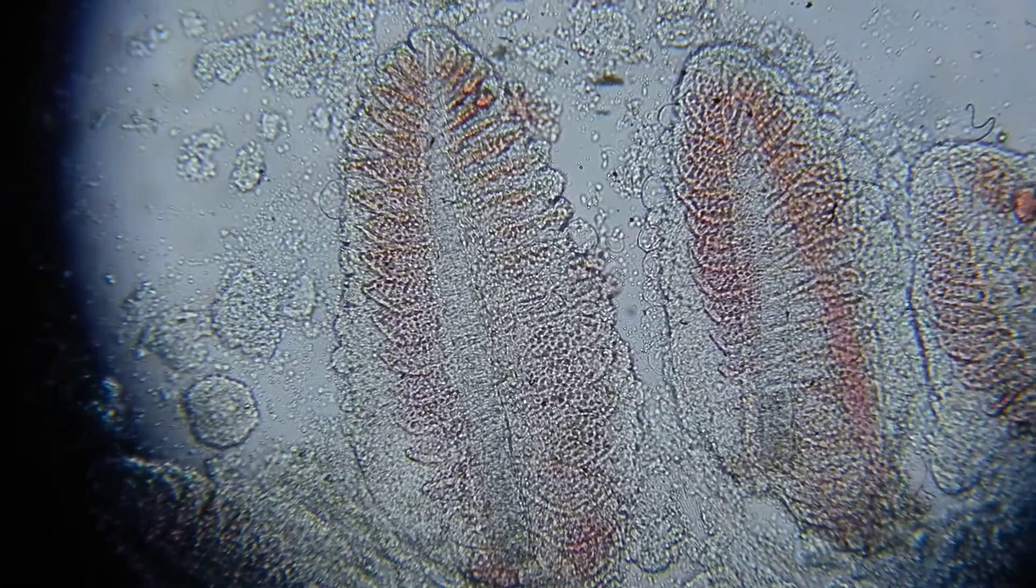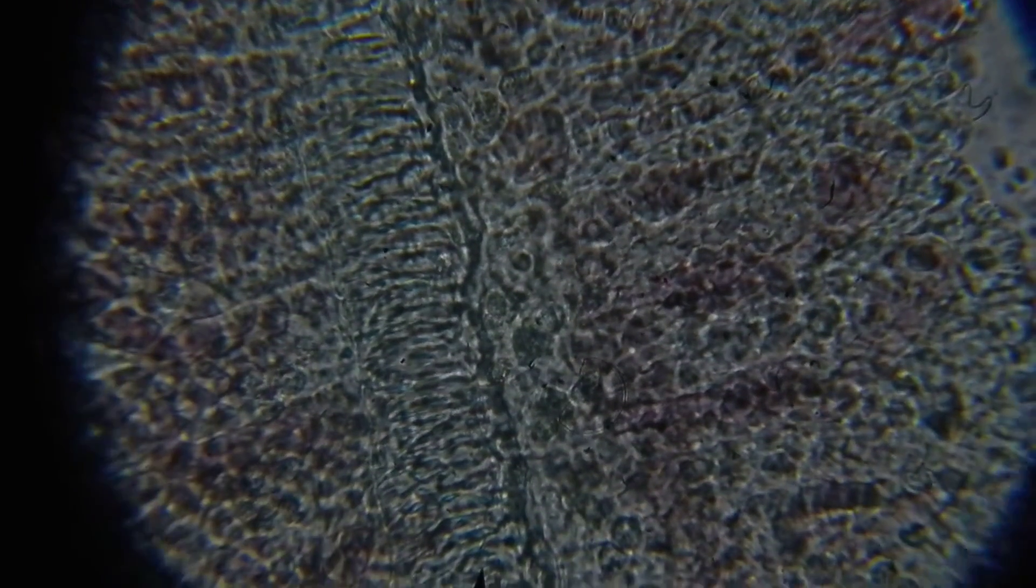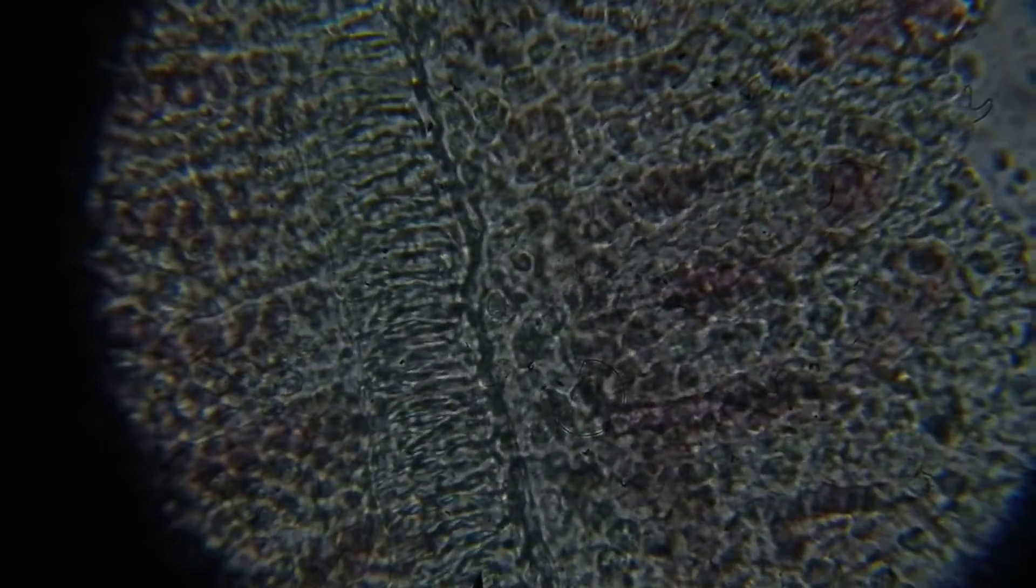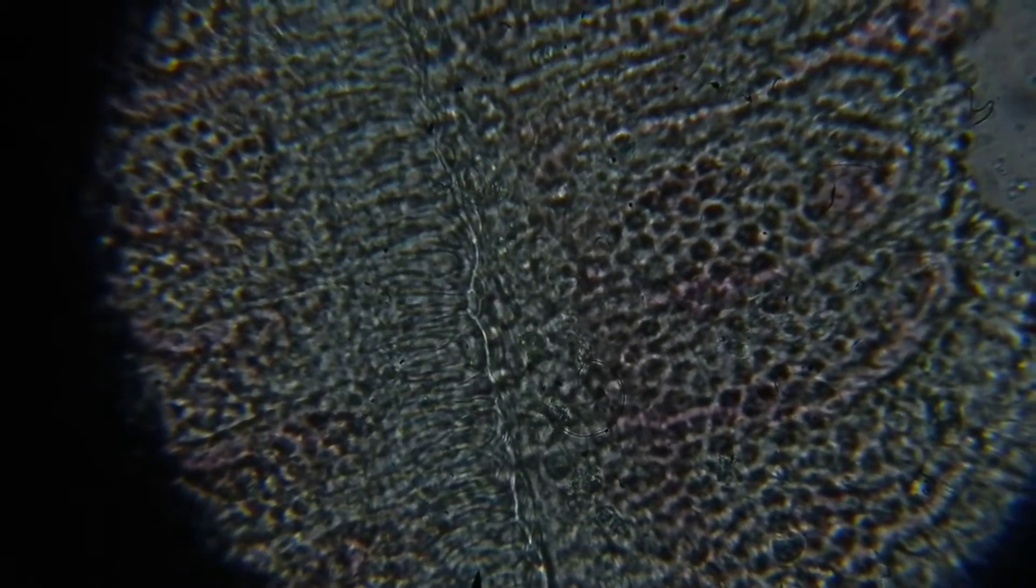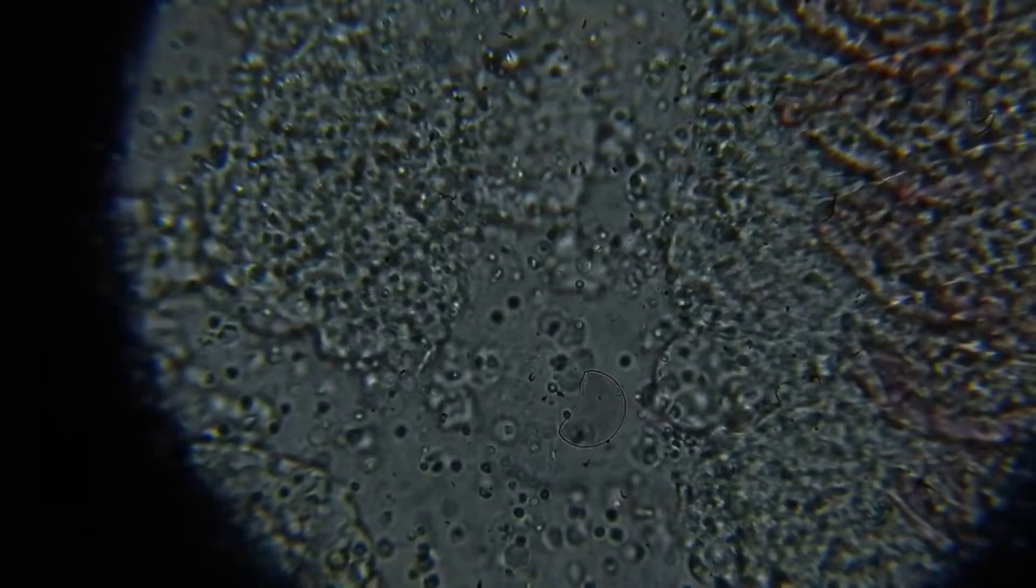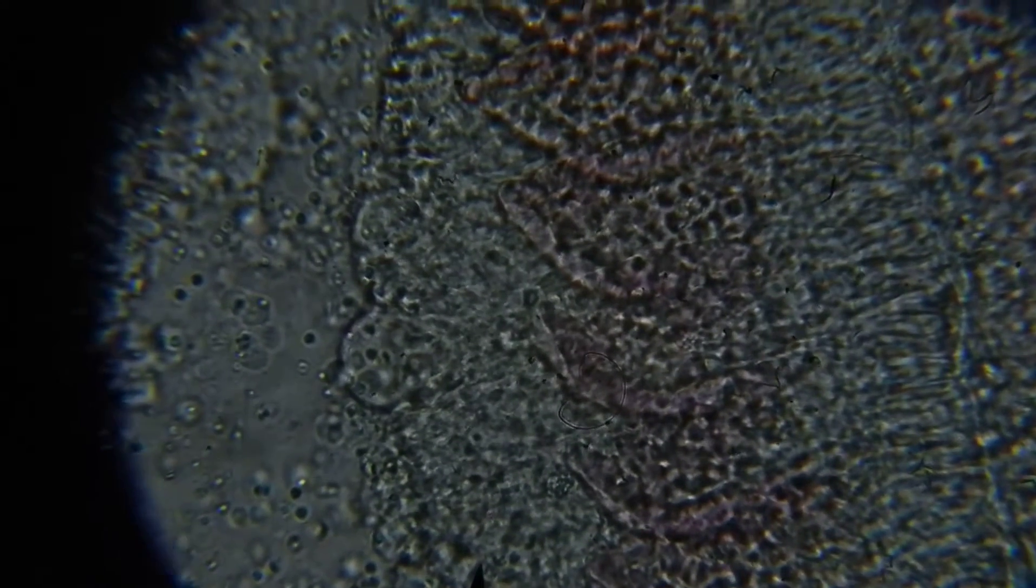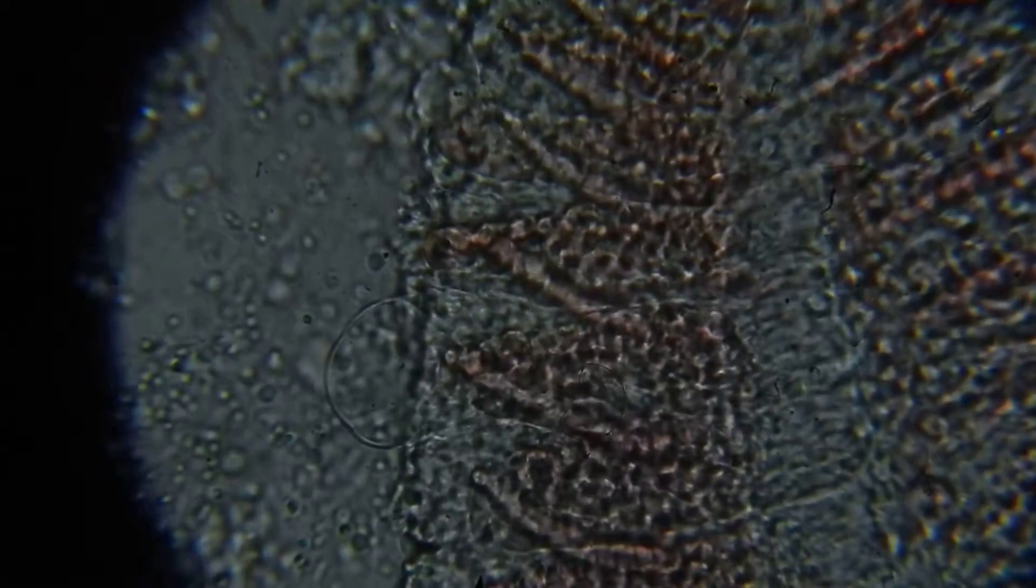So the blood would go one way and the water would be pumped the other way. But enough about structure and function. What you can also notice from this wet prep is that the amount of mucus, which is from here to about here, is sort of quite moderate and is quite low on this side. So this is what a normal healthy gill should look like. It shouldn't have too much mucus at all.